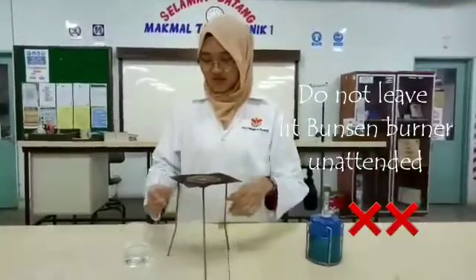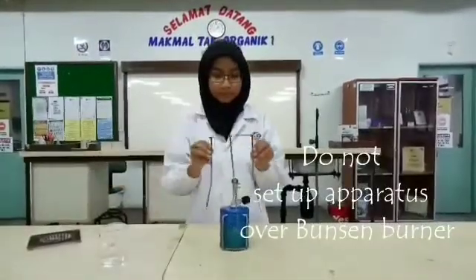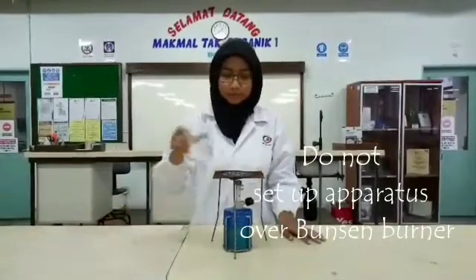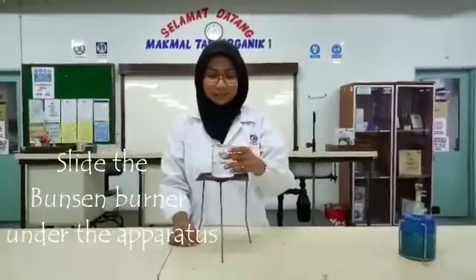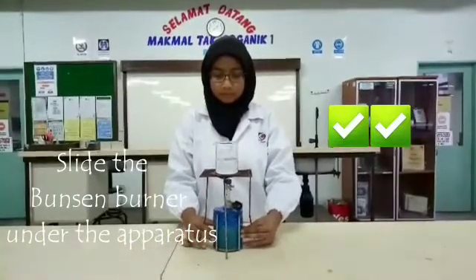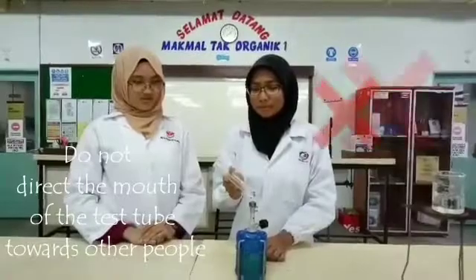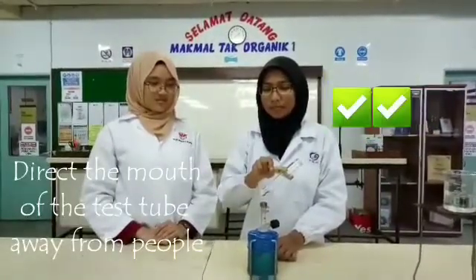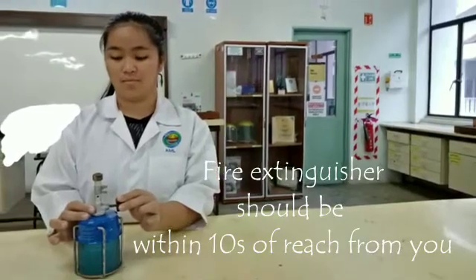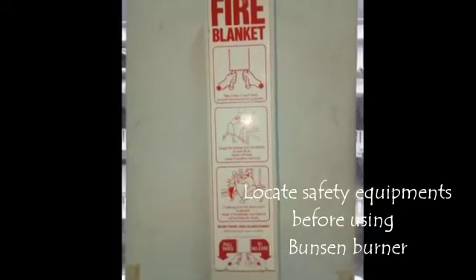Do not leave a lit Bunsen burner unattended. Do not set up apparatus over the Bunsen burner, and do not direct it towards you or towards others — always direct it away from people. The fire extinguisher should be within 10 seconds of reach from you. Locate safety equipment like the fire blanket before using the Bunsen burner.